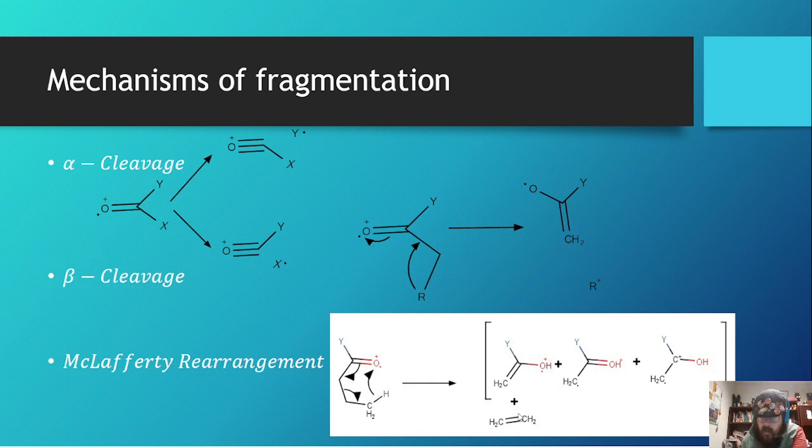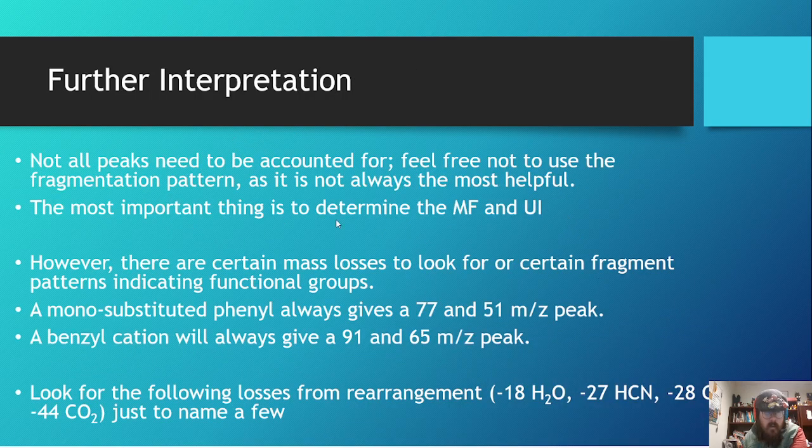So it kicks off ethene that you wouldn't normally expect. Now the fragmentation can serve to hint at the structure. For example, key fragments will always be present if we have certain functional groups, such as a monosubstituted phenyl group.